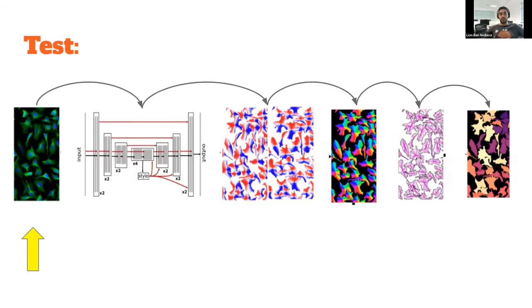Using this data, they trained a U-Net, and in the U-Net, they also passed the style. Here you can see it, like they did in the article that Alina talked about, Nucle AI there.